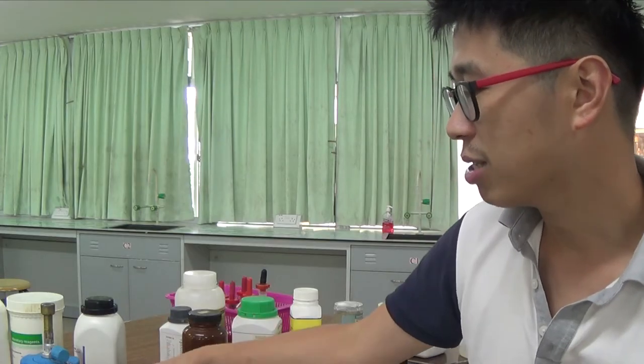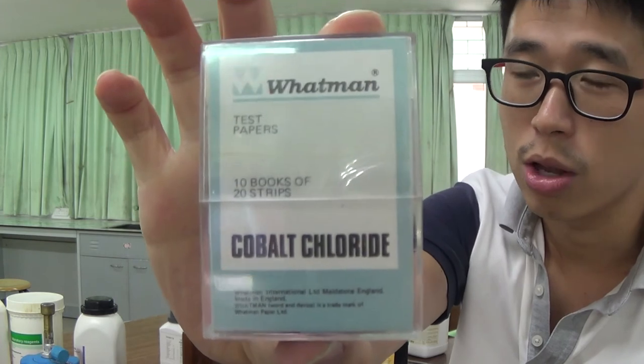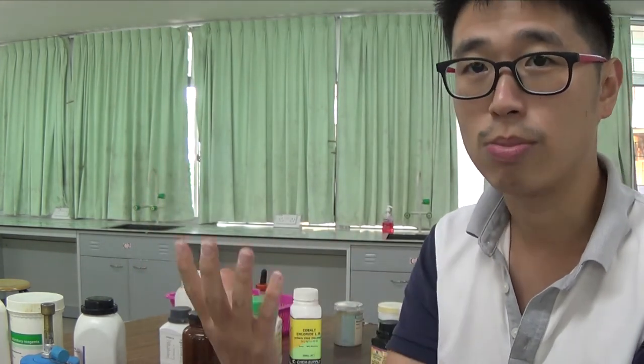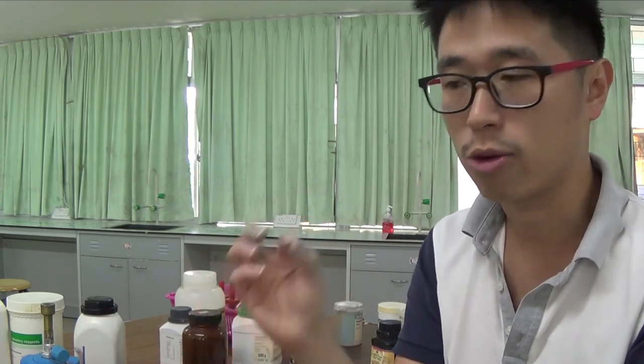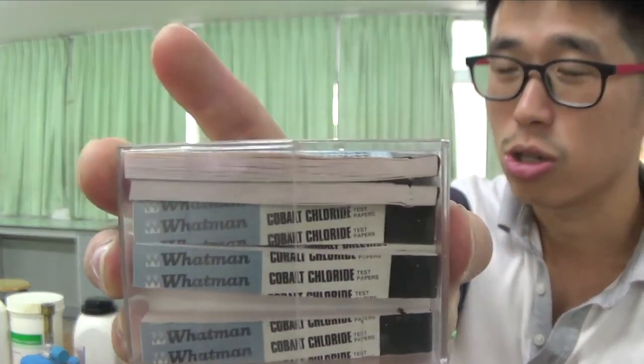Of course, the proper test of water would have been to use the anhydrous cobalt chloride. Anhydrous, as I talked about at the very beginning of this tutorial, means no water of crystallization. Hydrated means it has water of crystallization. This is a very old cobalt 2 chloride paper. It should have been blue.